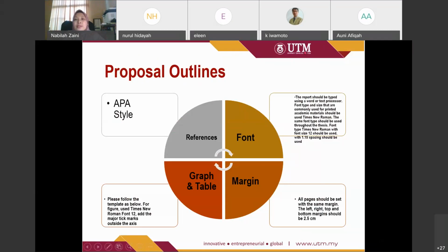Do you have any questions? Okay, there's a question. Doctor, do we need to conduct sublimation for both organic compounds? The answer is yes. The procedure is the same. However, the selected organic compounds are different. We want to know the outcomes from different selected organic compounds.